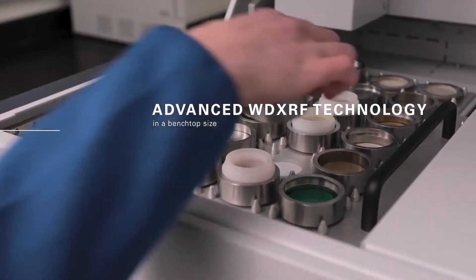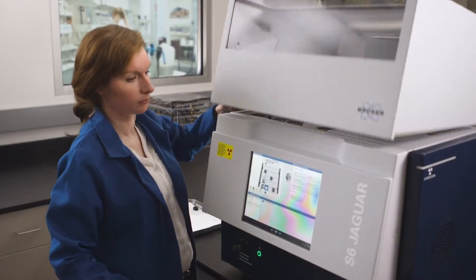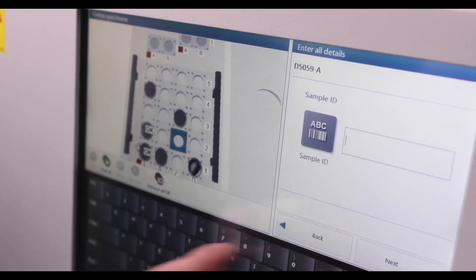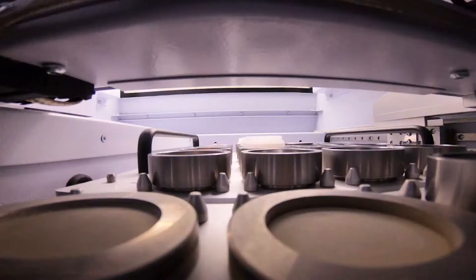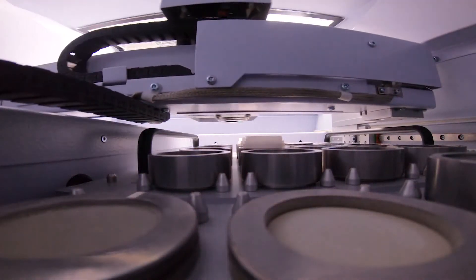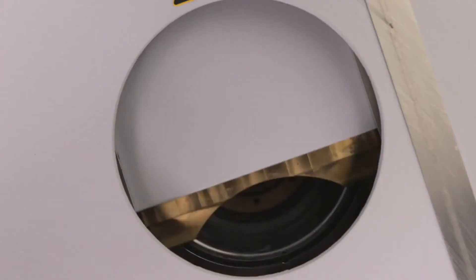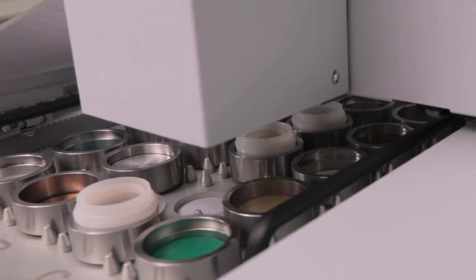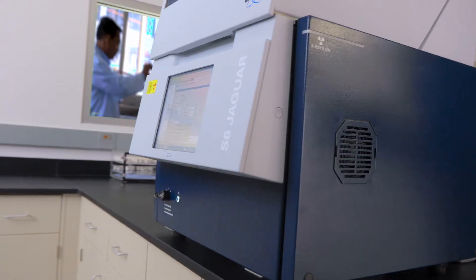Thanks to touch control, the operation of the S6 Jaguar is simple. With minimal training, your users can run routine samples while limiting access to the configuration and calibrations. Hisense detector technology makes the S6 Jaguar the master of analytical flexibility.